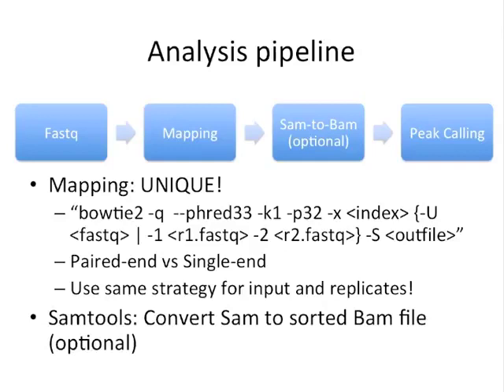The data we're going to be looking at today and examples in class are all going to be single end. And be sure to use the same exact strategy for your inputs as well as your replicates. That way you can compare them when you do the peak calling.